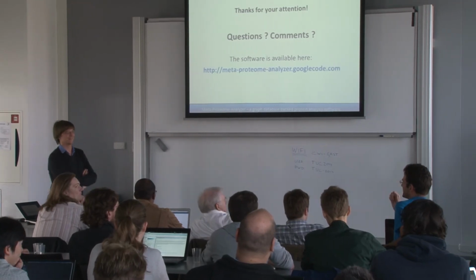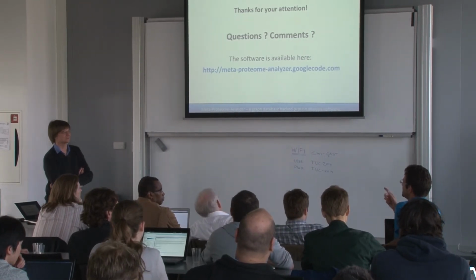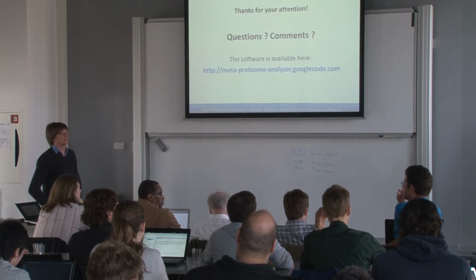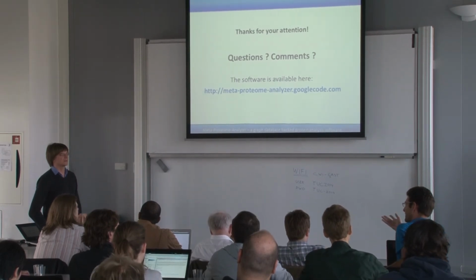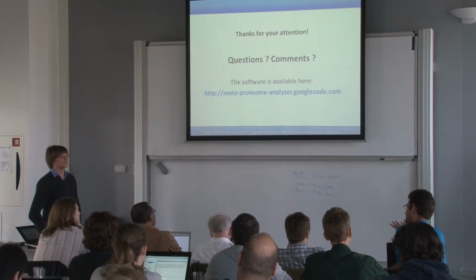Yeah, I have a few questions. So this is more my field. So just to summarize, you do mass spec, identify peptides, you get a subset of proteins, and you want to do this for all of it, for all proteins basically, not all proteins, but be able to detect any random protein and assign a certain sub-taxonomy to it.